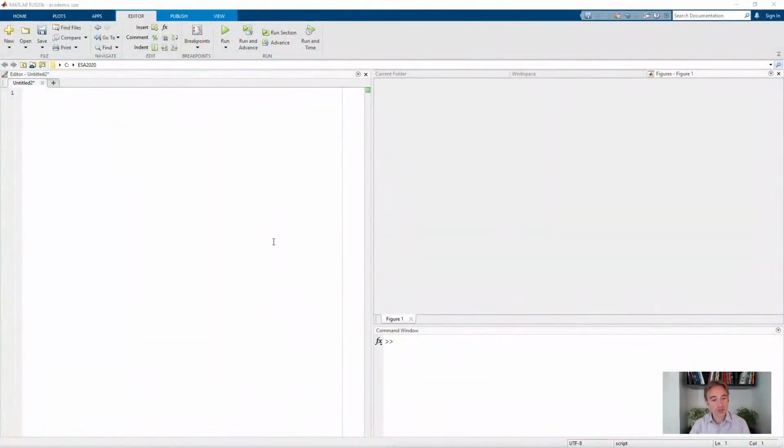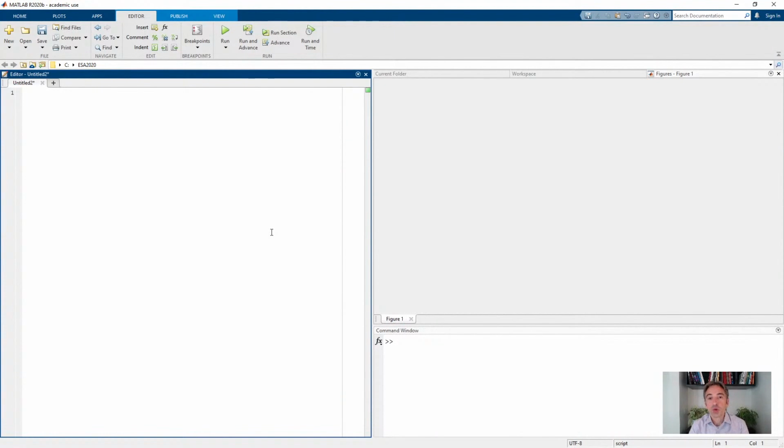In this session, we're going to look at the interface between EasySpin and ORCA, and we're also going to look at EasySpin's capabilities to simulate SQUID magnetometry data. First, let's look at the ORCA interface. EasySpin has a function to import ORCA calculation results, orca2easyspin.